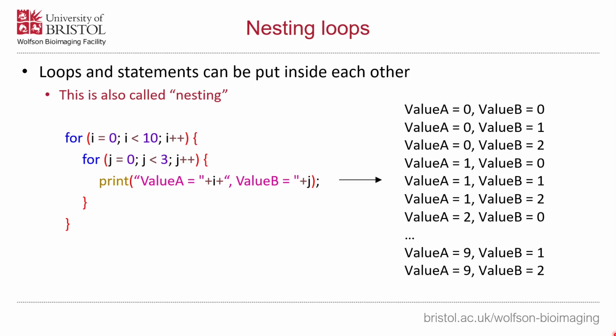I think it's the second exercise in Dom's worksheet, where you're going to be iterating over a few numbers and then have a conditional statement in there that prints whether or not that value is odd or even. Another thing that you could do is actually have another loop within a loop. So this whole idea is called nesting, and the reason that you might want to do this, especially in the context of what you'll be doing again later in the worksheet in the second section, will be iterating over multiple objects, trying to measure those nearest neighbor distances.